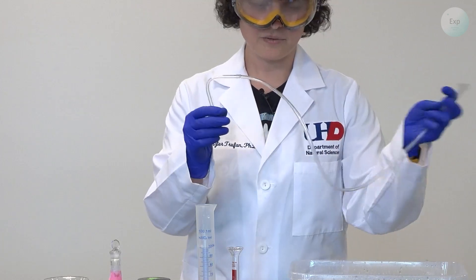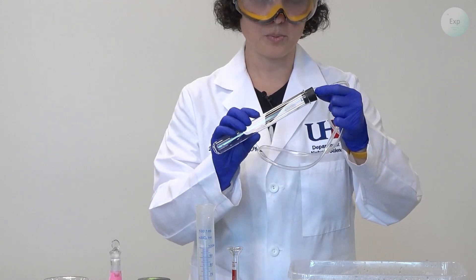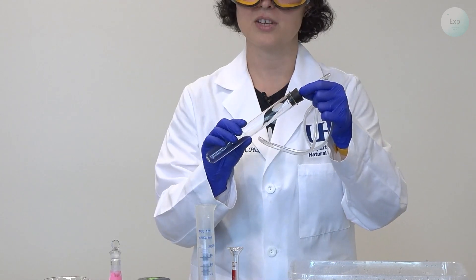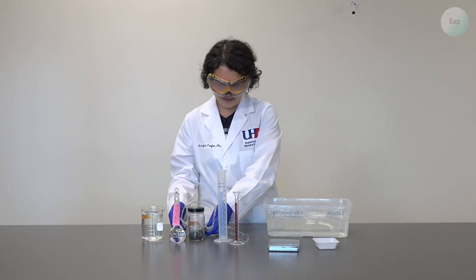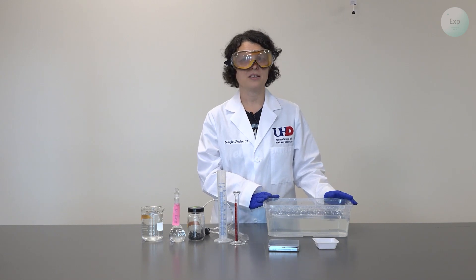We'll also need a rubber tubing connected to a glass tubing and to a rubber stopper. This rubber stopper needs to be of appropriate size to fit into our large test tube. And finally, we will need to collect the temperature of the water, which means we're going to need a thermometer.